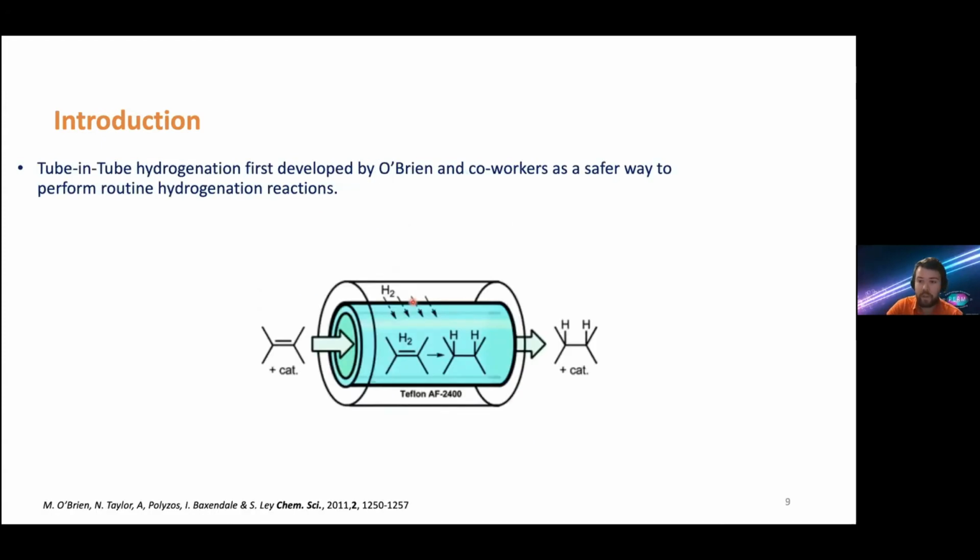Now, most of the sidearm hydrogenation that's done is done in a batch process, meaning you bubble, you get your hyperpolarized biomolecule, and then you use it. However, I think it would be good, and we saw in Silvio Aimi's talk, that if they could do this in a continuous flow and really just continuously produce these hyperpolarized biomolecules, it would cut down on cost and make them easier to implement, I think. One way you can do this continuous flow is using a porous, gas permeable membrane.